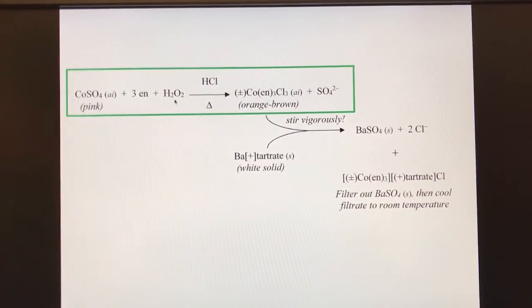And then we have a very strong oxidant because this is 30% hydrogen peroxide, 10 times more concentrated than what you can buy over the counter. So we do want you to be very careful. You will be wearing gloves the whole entire, every day you're doing the synthesis. That is very important. So you'll be creating this racemic mixture at first.